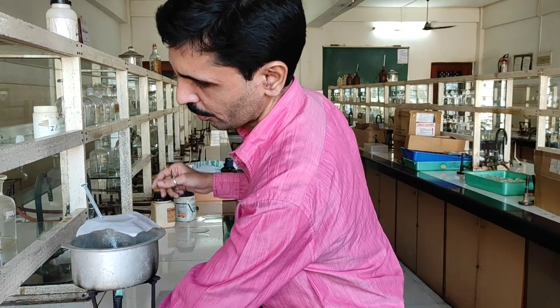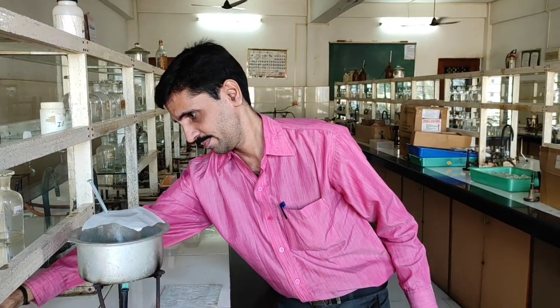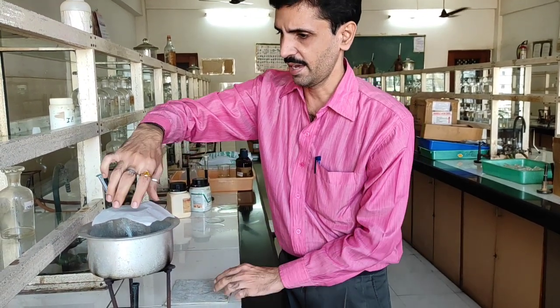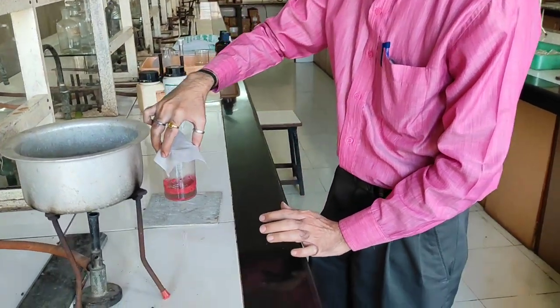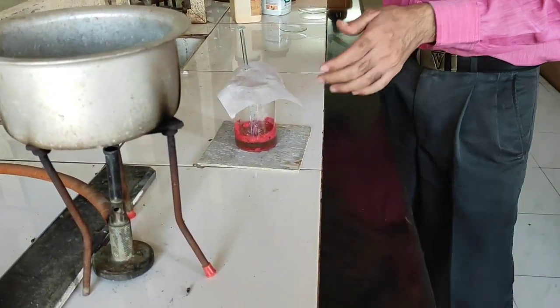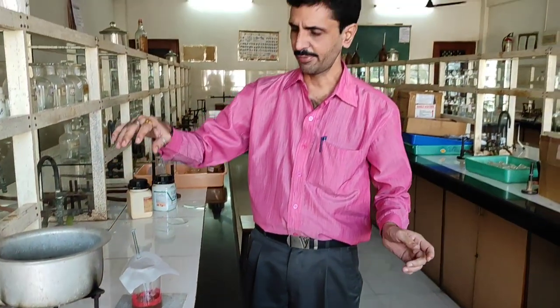My dear friends, we can see that 30 minutes are done after the digestion process. So we will just put off the burner. Very slowly we will hold the beaker and put it on the asbestos sheet. This is what we get after the process of digestion. Now once the digestion process is done, let us allow it to cool on the asbestos sheet for some time.